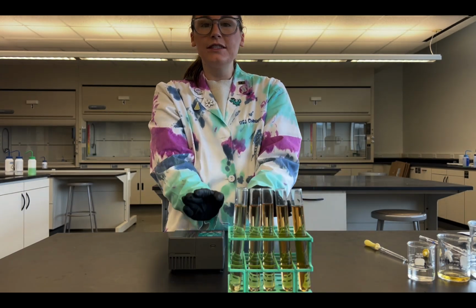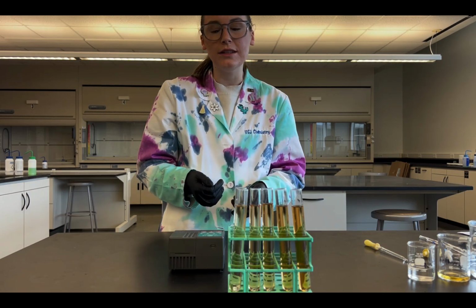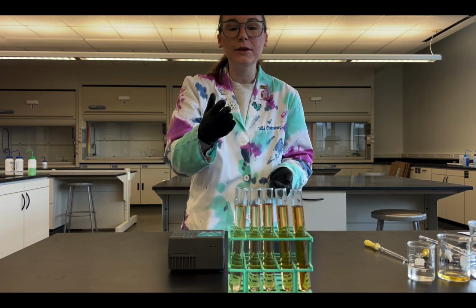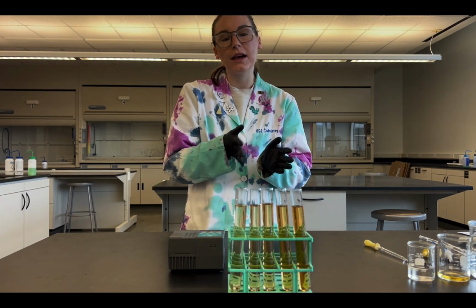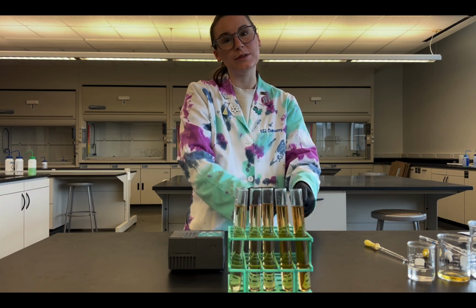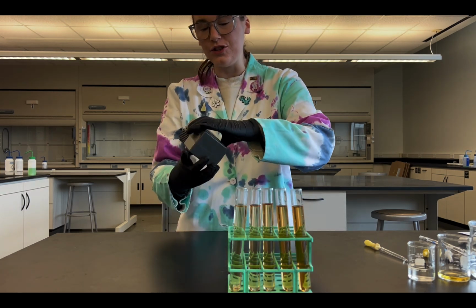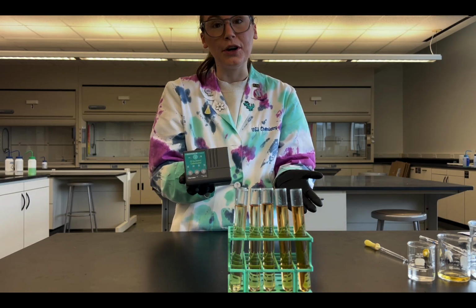So now that we have our standard solutions and we can now calculate their concentrations, the next thing that we need to find is the absorbance. How much light do each of these solutions absorb now that my concentrations are varied at specific amounts that I now know? So what we're going to do for that is use this thing called a spectrophotometer, also known as a colorimeter.